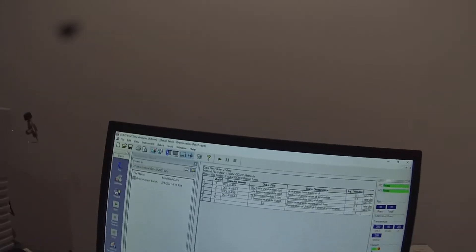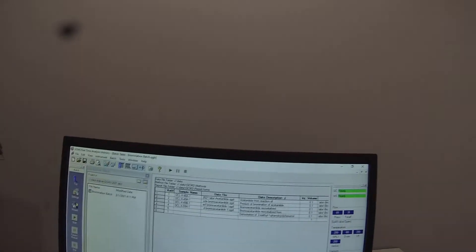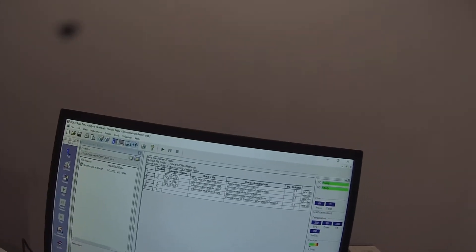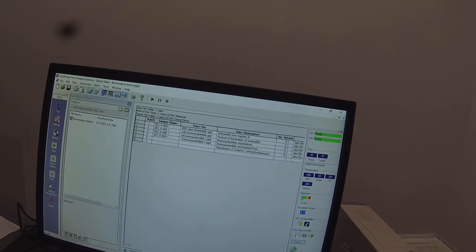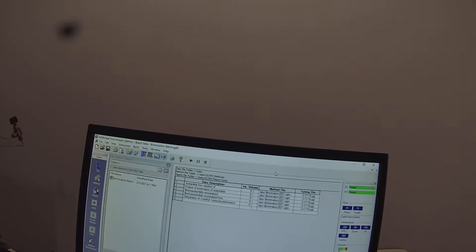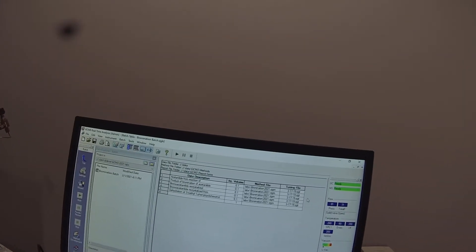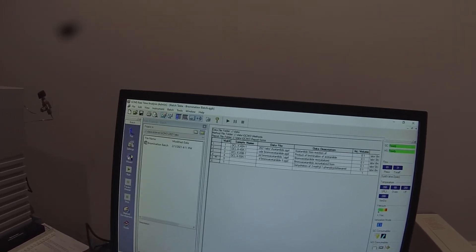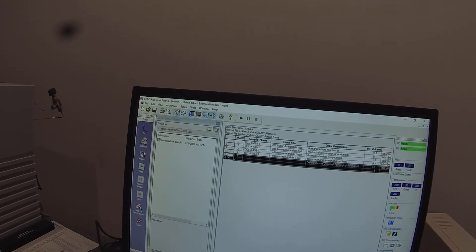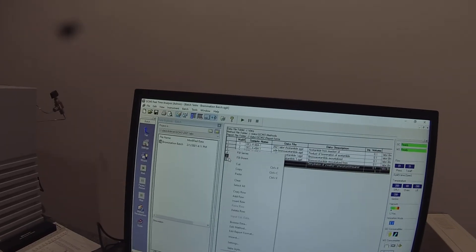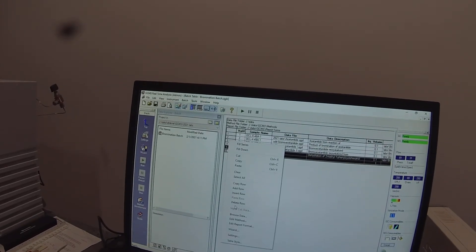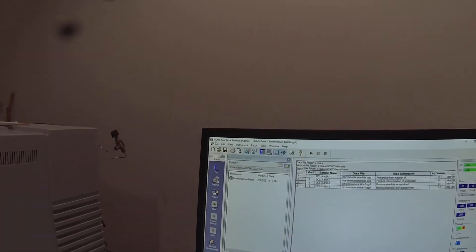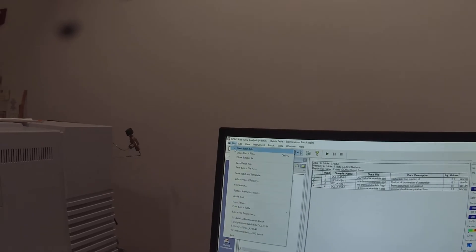My file names look good. Crude and purified. I've got my data description in there. The injection volumes and the tuning file, everything's correct. So we'll delete those last two rows. Right click delete row and save that batch file.